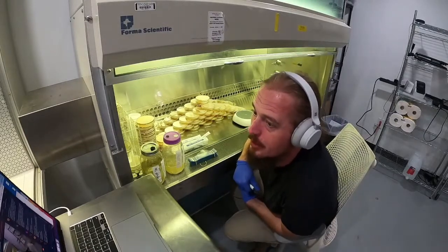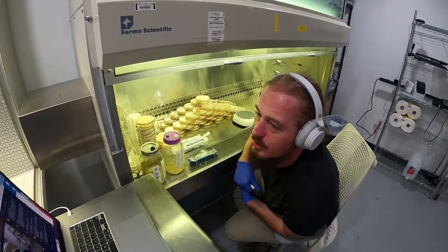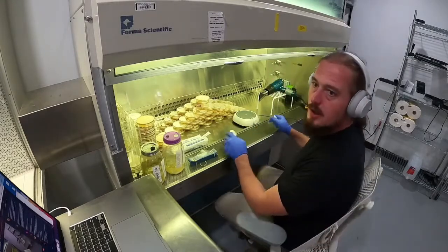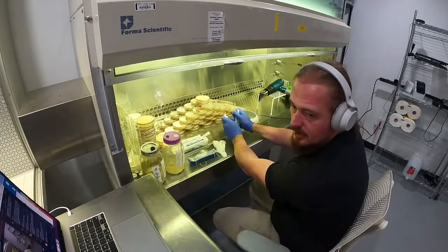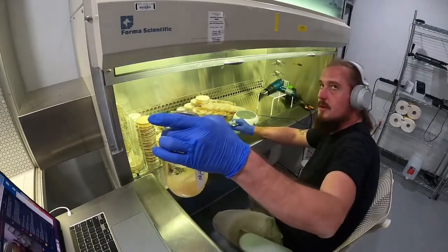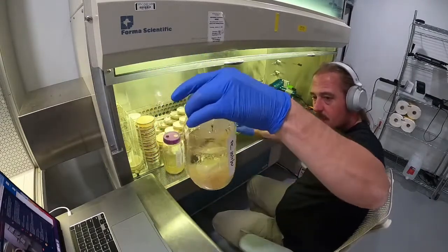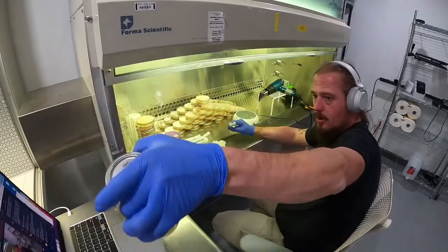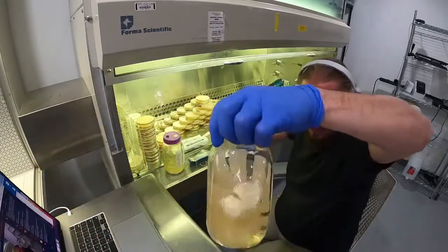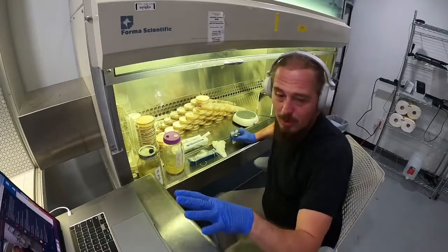So, liquid culture, running a magnetic stirrer the whole time. Basically, don't overthink liquid cultures. This liquid culture is 25 grams of honey to 900 ml water. I don't stir these constantly. You can see it's got like this big old baby in there. Like some of these are fruiting. Like if I, oh, hold on. Let me blow all of your minds.